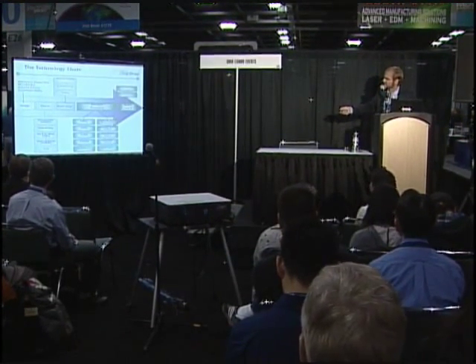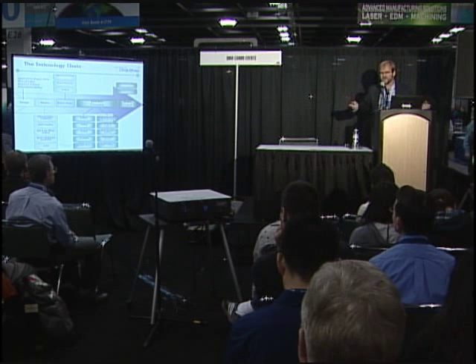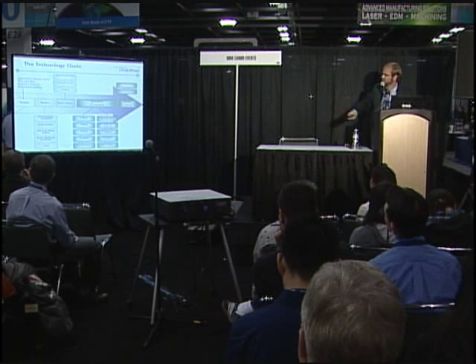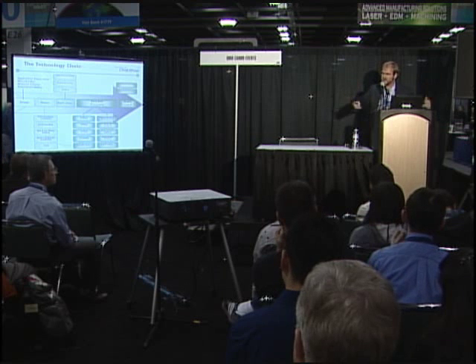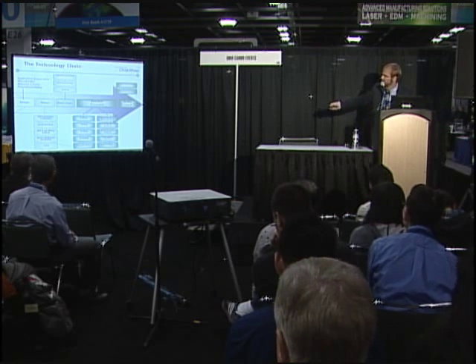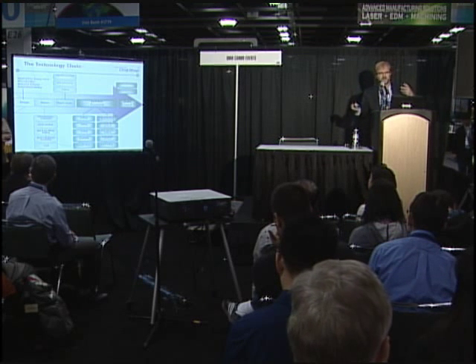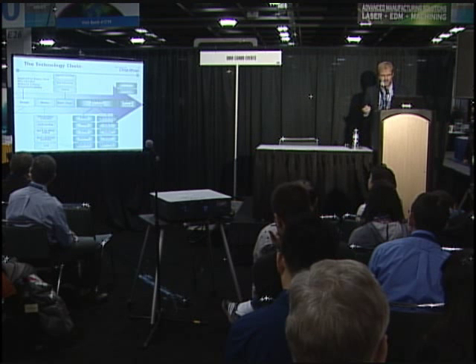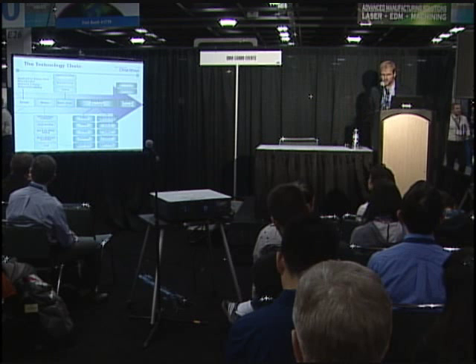At that point, you have a microfabricated polymer part, and to make a functioning microfluidic device out of it, you have to go through all these back-end processing steps. The physical ones like drilling holes, cutting, dicing, sealing, assembly if you have filters or membranes in there or sensors, metallization if you want to make electrodes, and the chemistry-related ones like the immobilization of biomolecules, the tuning of hydrophilicity, on-chip reagent storage and stuff like that, and finally quality control.